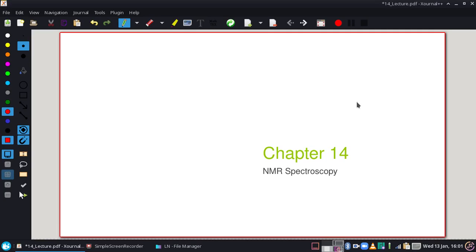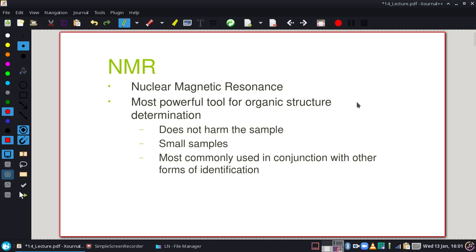Okay, today we're going to be looking at nuclear magnetic resonance spectroscopy, NMR spectroscopy, which is a very useful tool we use in the organic world to help us determine if you were successful in making a particular organic structure. Typically, it's safe to say we can use an NMR to tell exactly if we actually made what we wanted to. And with the right NMR and the right skill, you can actually tell exactly how a molecule is put together down to the minuscule little detail.